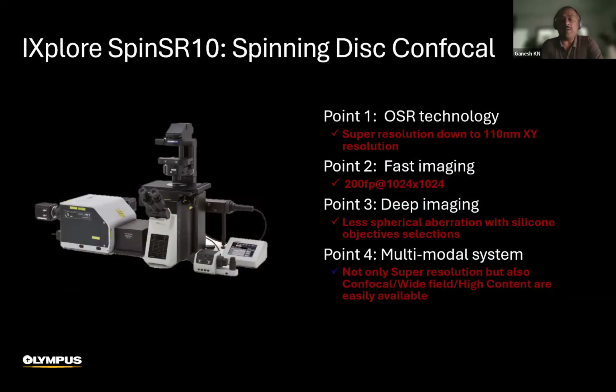So point scanning confocal microscope was replaced by a multi-point scanning confocal microscope called spinning disk confocal microscope, where a disk rotates at a speed of 4,000 RPM with thousands of pinholes engraved on it, and it showers multiple beams of light onto the specimen without overlapping each other, and as it rotates it makes sure that the sample is illuminated throughout.